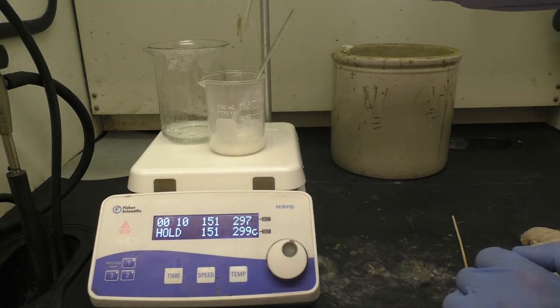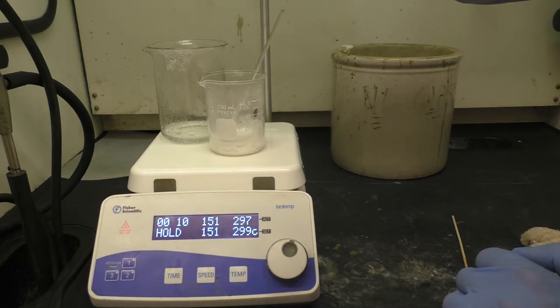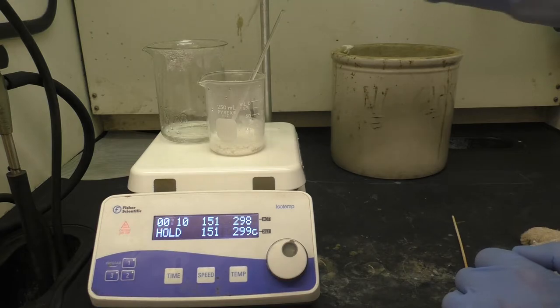So you should be able to see in a little bit, as this solution boils, that solid begin to dissolve. We'll go until we get all of the solid completely dissolved.